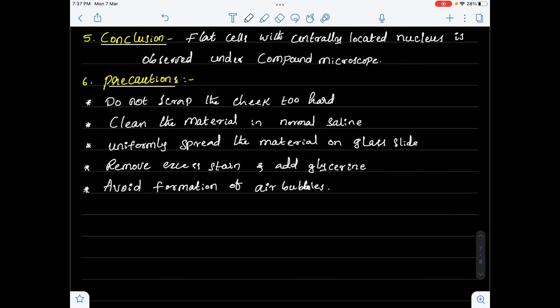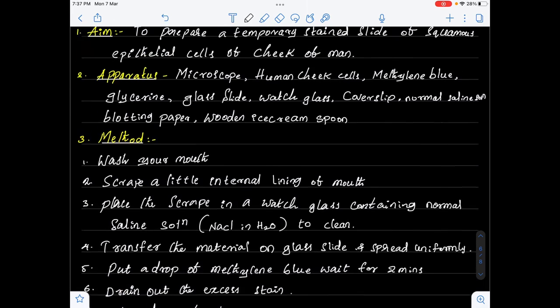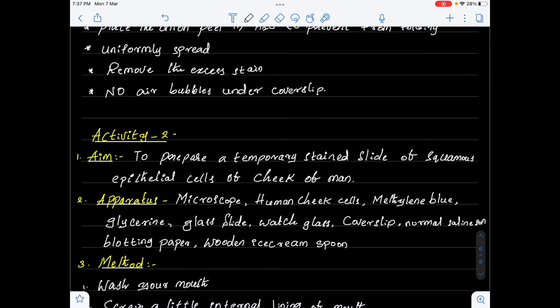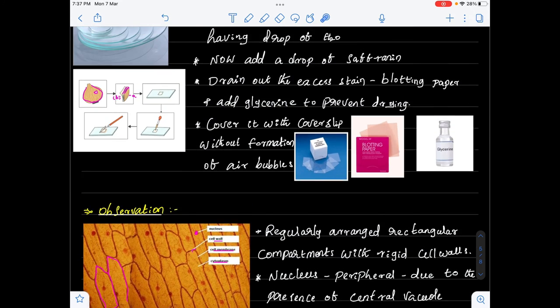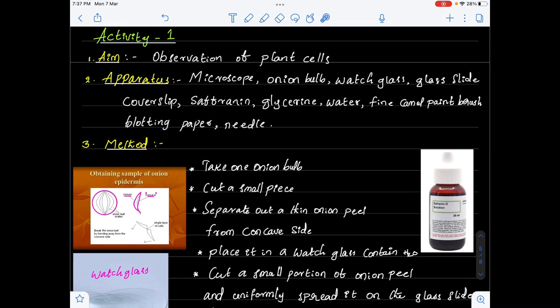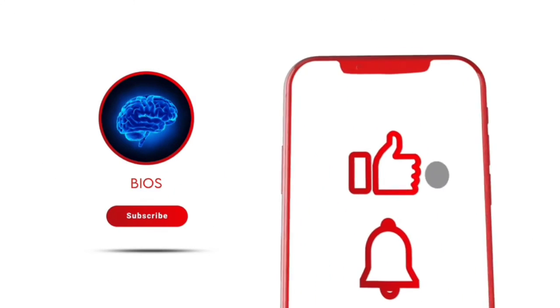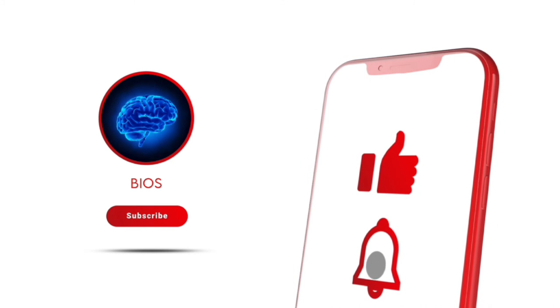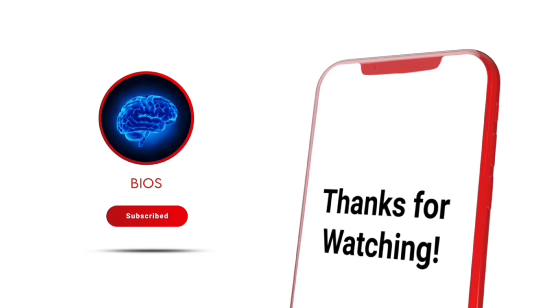So this is about the observation of human cheek cells and plant cells under the compound microscope.